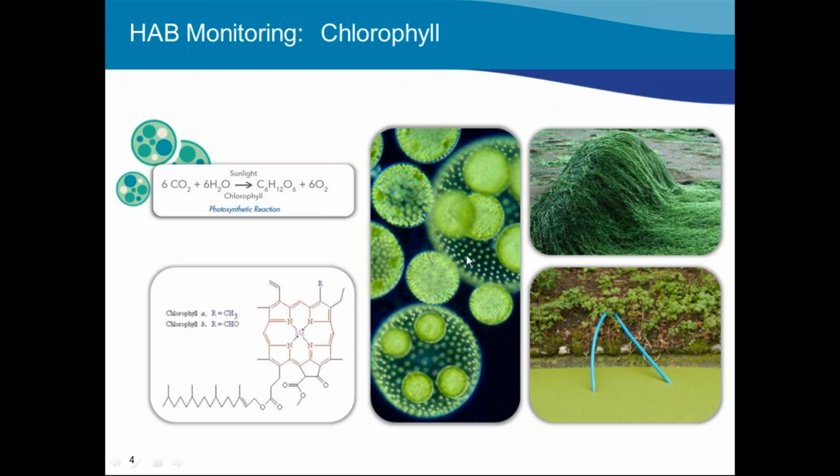And chlorophyll is the pigment that you don't just find in blue-green algae, but actually in all algae, including seaweeds, eukaryotic algae, blue-green algae, and everything on up to higher plants. And of course, that's because all of these organisms are performing photosynthesis, where they're converting the energy from sunlight into cellular fixed carbon.